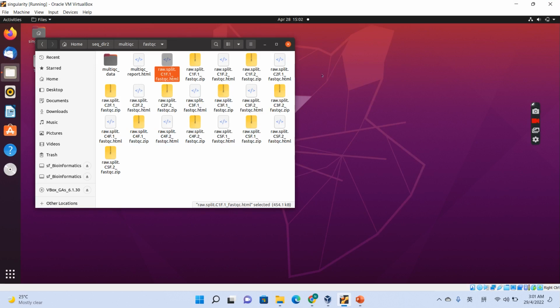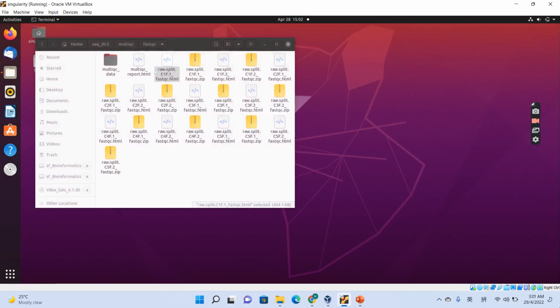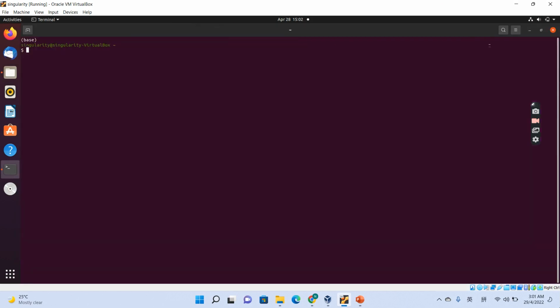So let's say you have multiple results from FASTQC.